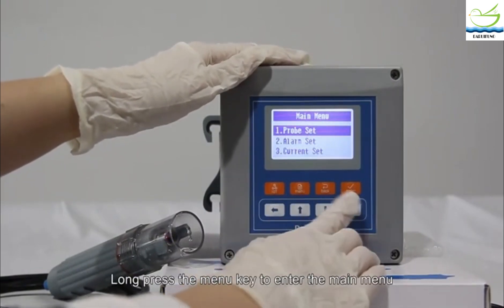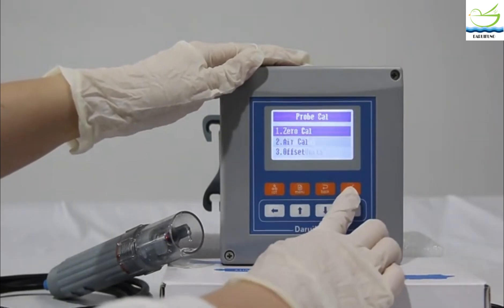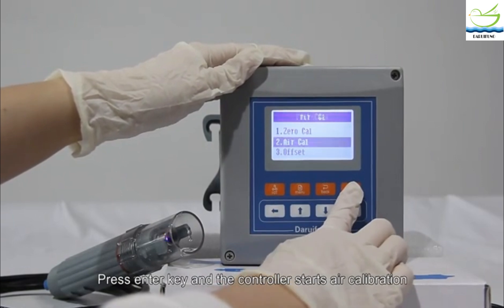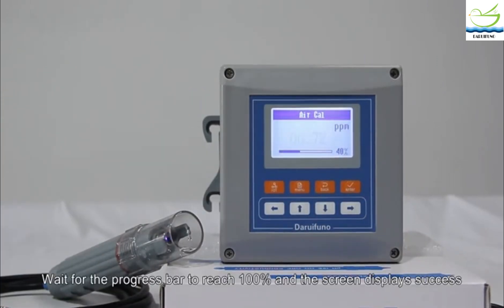Select Probe Set, then Probe Cal, then Air Cal. Press the enter key and the controller starts the air calibration. Wait for the progress bar to reach 100% and the screen displays success.